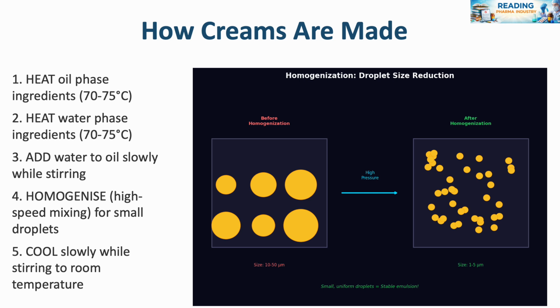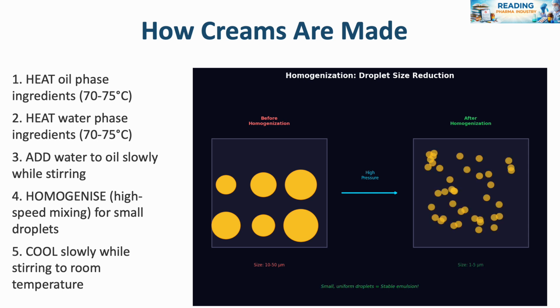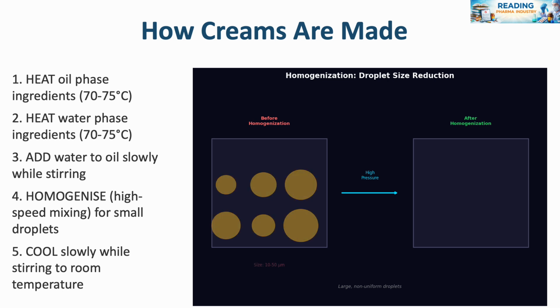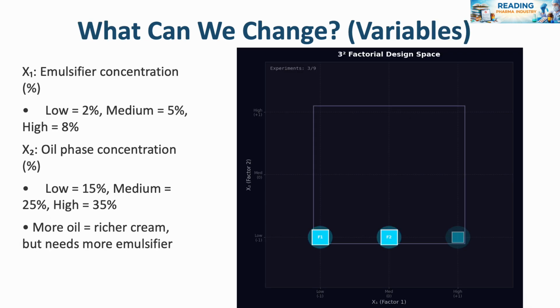And with the mixing, you are providing energy to the system, so you're breaking those into smaller and smaller droplets. Surfactant will coat those smaller droplets and will help stabilize them, forming these kind of barriers or bridges, more or less, lamellar phases. Lamellar phases are aggregations of the surfactant molecules, and that enhances the viscosity and gives the cream its unique structure. So what are the variables that we can change to ensure a good formulation is produced?